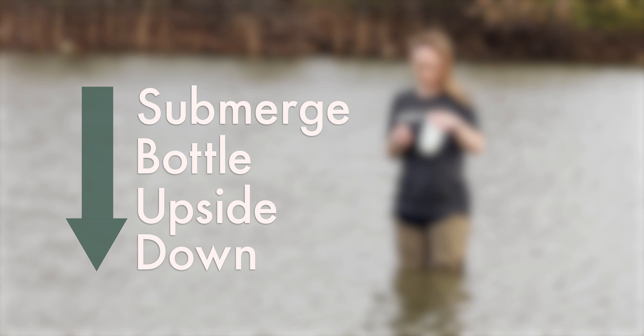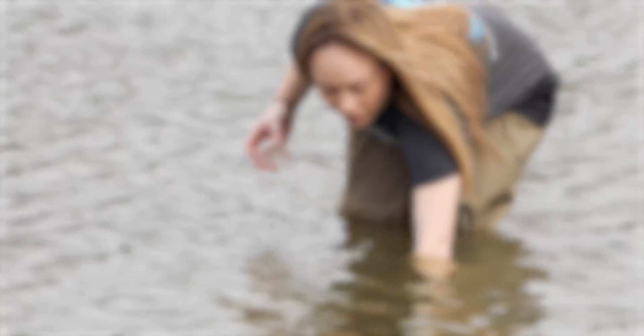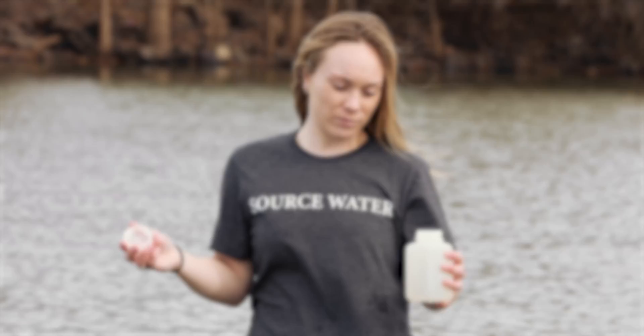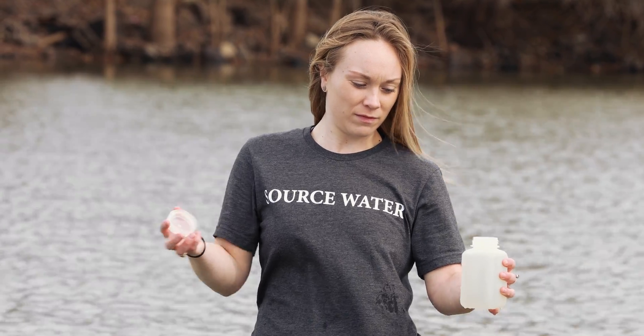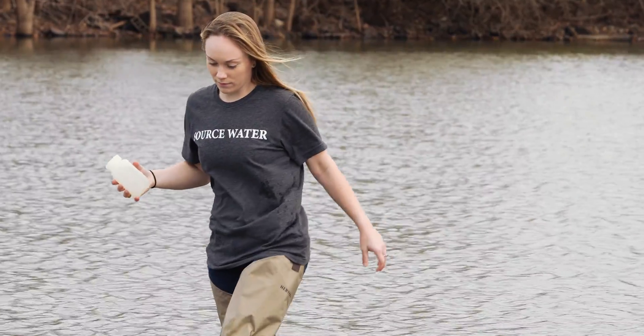Finally, holding your triple rinsed sample bottle upside down, submerge the bottle to a depth of either 6 to 12 inches or about midway between the surface and pond bottom, depending on the depth of your sampling point. Then turn the bottle right side up and allow it to fill with water. Leave approximately one inch of head space at the top of the bottle. It's okay to pour out a little bit of sample to leave the extra air space at the top. Cap your filled bottle and exit the pond.